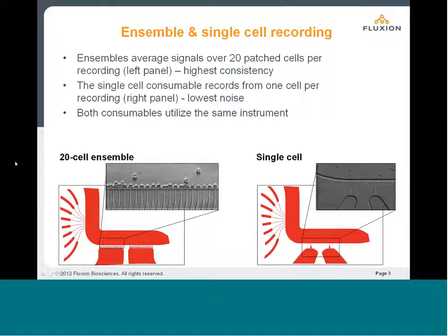As I mentioned, we have both an ensemble and single cell recording configuration, and these are shown at the bottom.